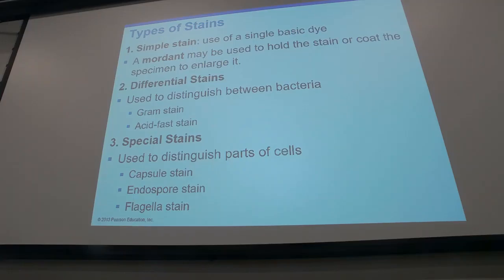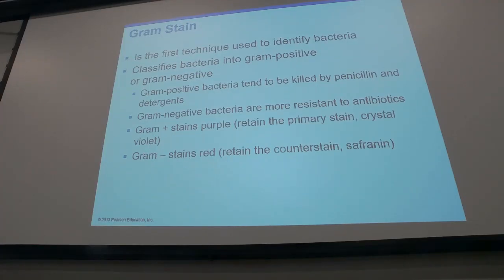Or you can stain extensions of the cell wall that the bacteria uses to move, like flagella. So in this case, you use special stains or structural stains.